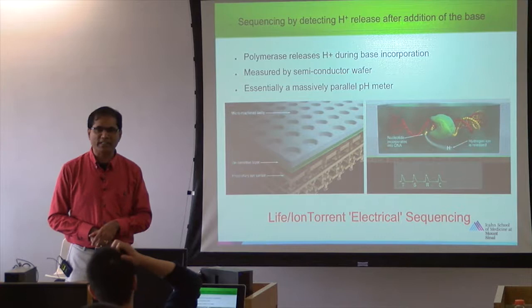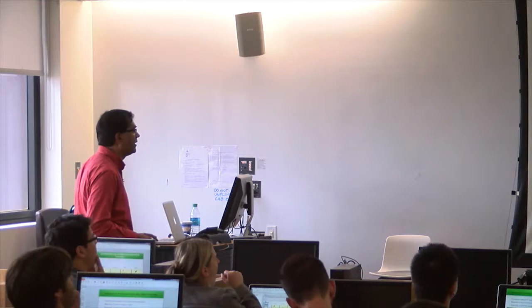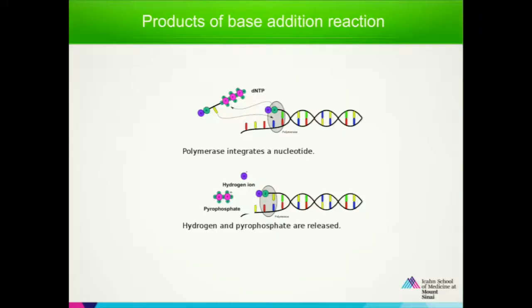If I go back to explain to you, this is not the hydrogen bonding between these. Not hydrogen bonding between these, but it is the release of this hydrogen. Hydrogen bonding is between these. Okay? This is the hydrogen ion that is released in the medium during this reaction. You are detecting that release.